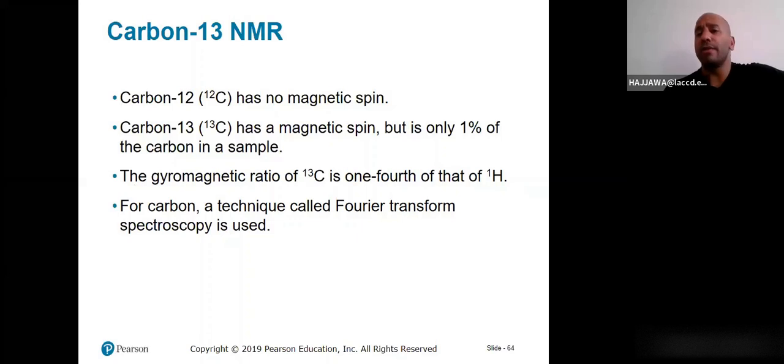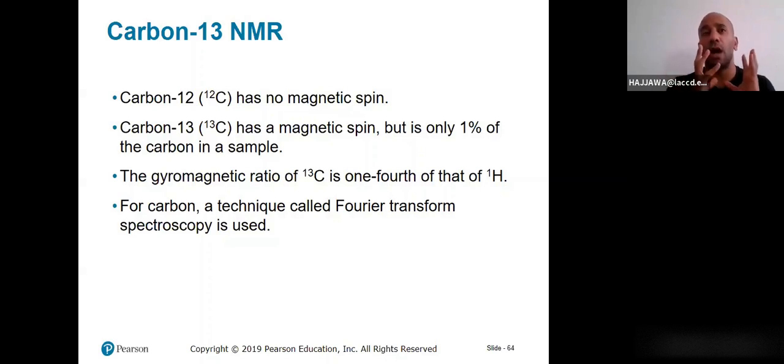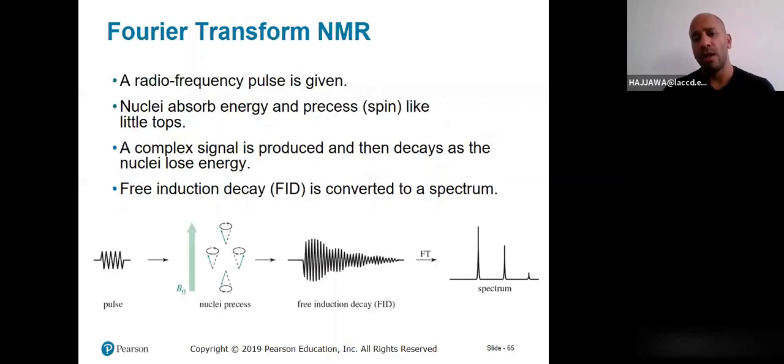All right, carbon-13 NMR. It's another tool that we use to confirm connectivity of a molecule. What is that supposed to mean? Most of the time, we're going to rely on the proton NMR spectrum to figure out how the structure is connected. Next, we're going to use the carbon-13, if needed, to confirm a molecule. And I'm going to rely on one method that's really useful when it comes to carbon-13 NMR.